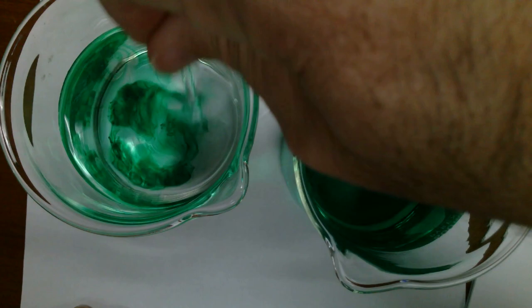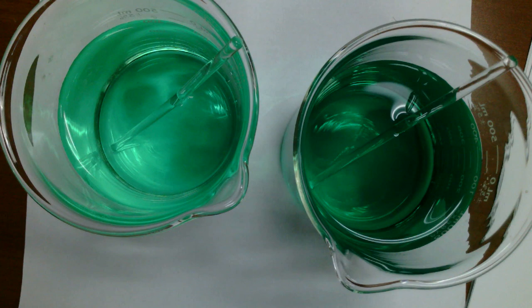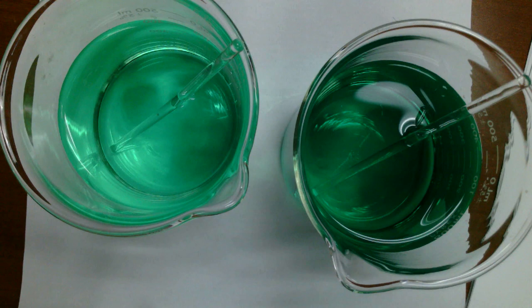And what we can see is the more dilute one that I prepared with only one drop of food coloring has a lot less color than the one with four drops, okay? So this part kind of makes sense, right? The higher the concentration of the colored solution, the more intense it is, okay?